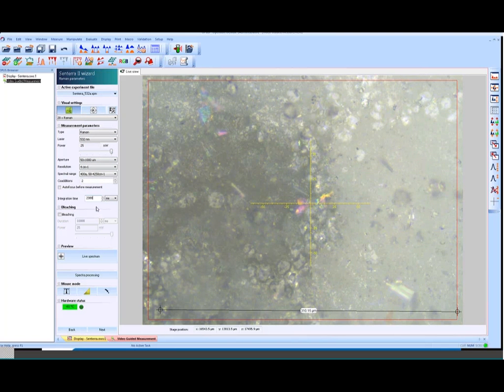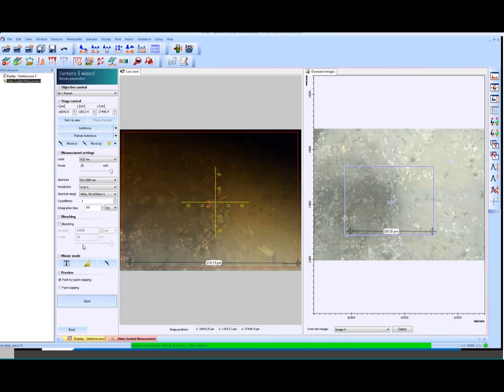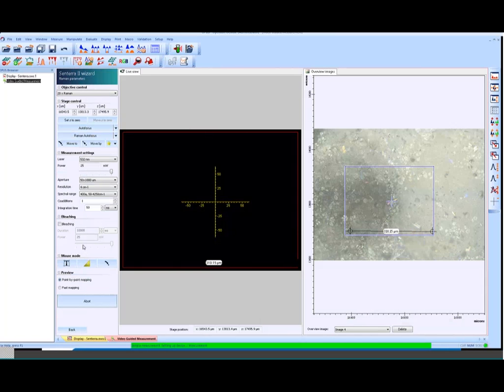time a little bit. So in the next step, I push this live spectrum button here, and then we will see a window popping up showing us the area which we have taken by the snapshot. And then, of course, we will see the real-time live spectrum in a minute.